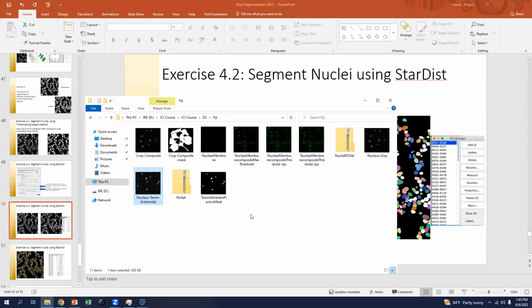If we don't cover it tomorrow, that'd be the consultation. Okay, cool, yeah. I messed around with them a little bit and I think I just have a few lines that aren't in there that I cannot quite do what I want. Yeah, usually with writing macros or using the record function, the thing that trips me up is being able to tell which image was picked to do it. Yes, exactly. I actually ran into that exact thing when I wrote my thesis. Yeah. That's basically the function I've been running.